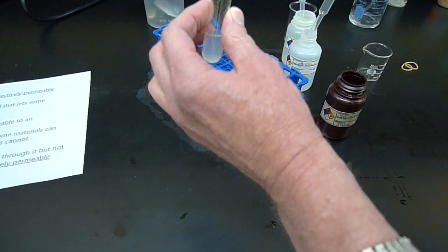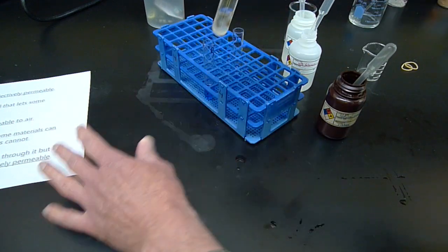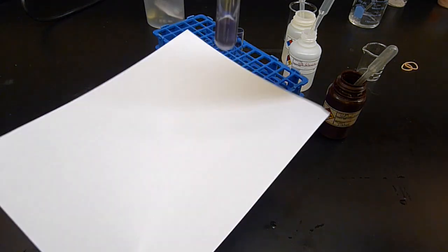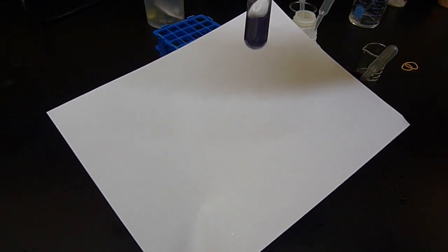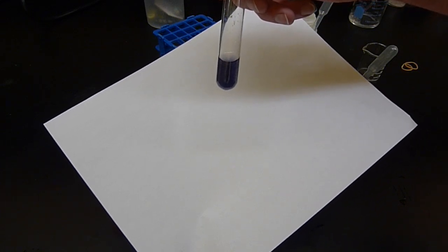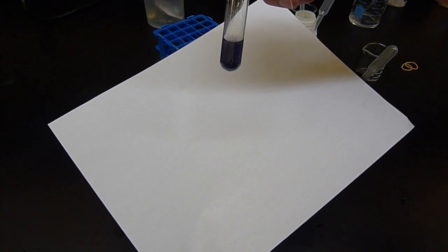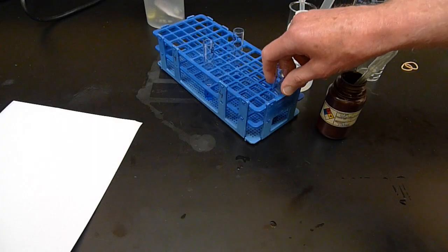Here is a drop of iodine into the starch, and remember what happens: you get a black or darkish color developing. This is fairly dark, with a little bit of a purple-grayish cast, and there are some particles in there, if you can see that in the camera too. That's the starch, which is not entirely soluble, absorbing the iodine and changing color. So that's the starch test with iodine.